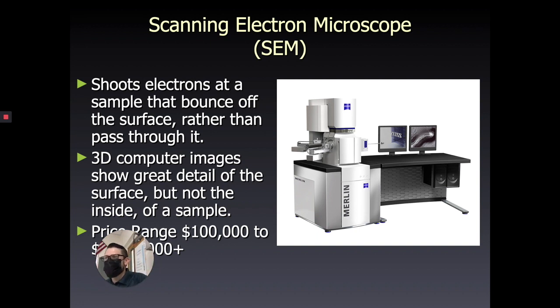of that object. And we're not limited by size as well, because you don't have to have a very thin sample. You can have a relatively large sample and put it inside this microscope. The way this microscope works is, if you notice in the picture here, there's like a little door. Okay, you open that door, this is what is called the imaging chamber. And whatever fits inside of that imaging chamber, we can then image with that microscope.